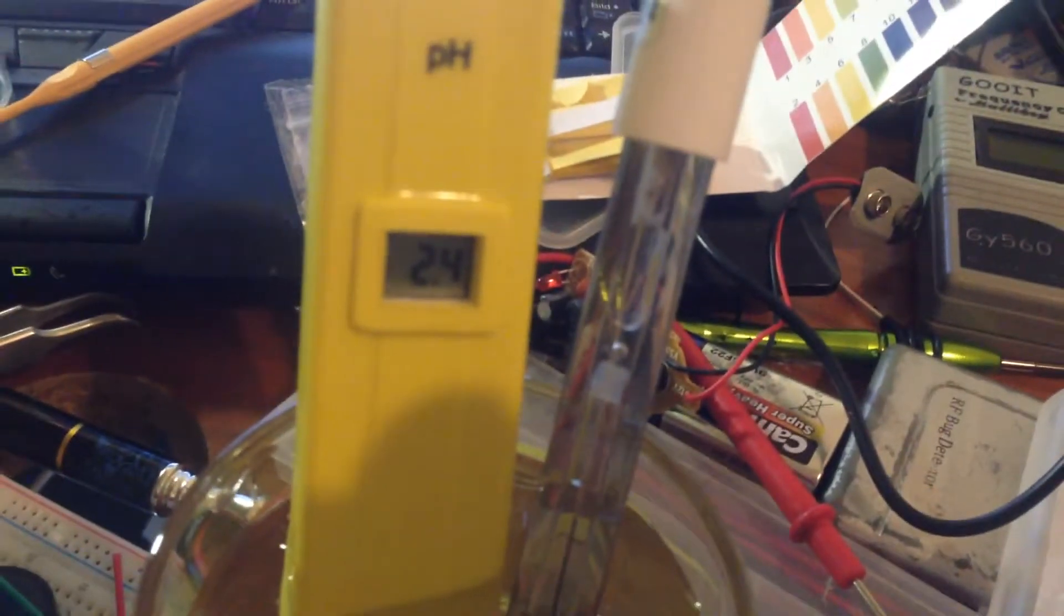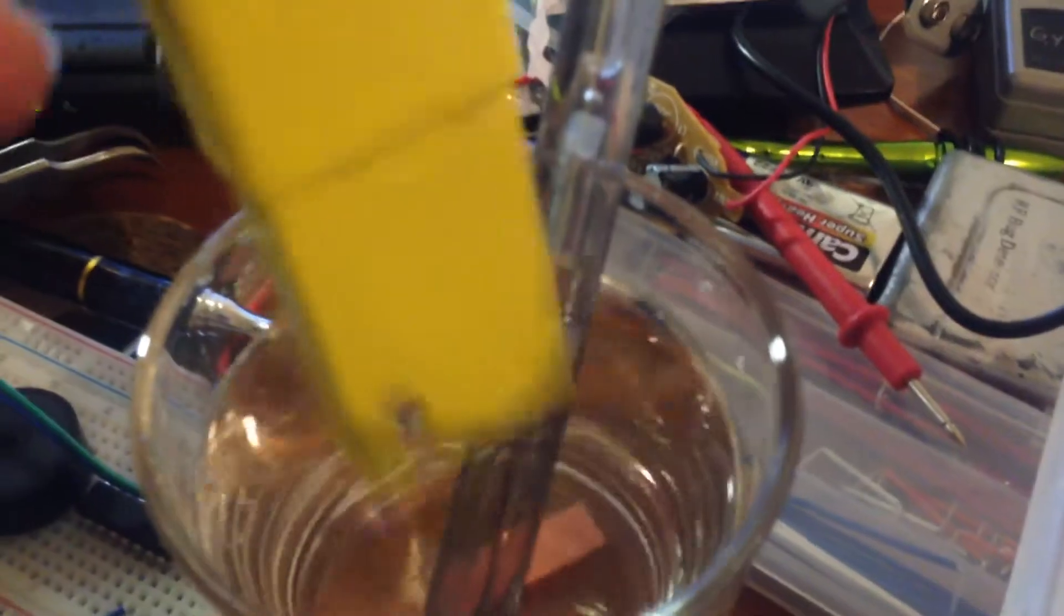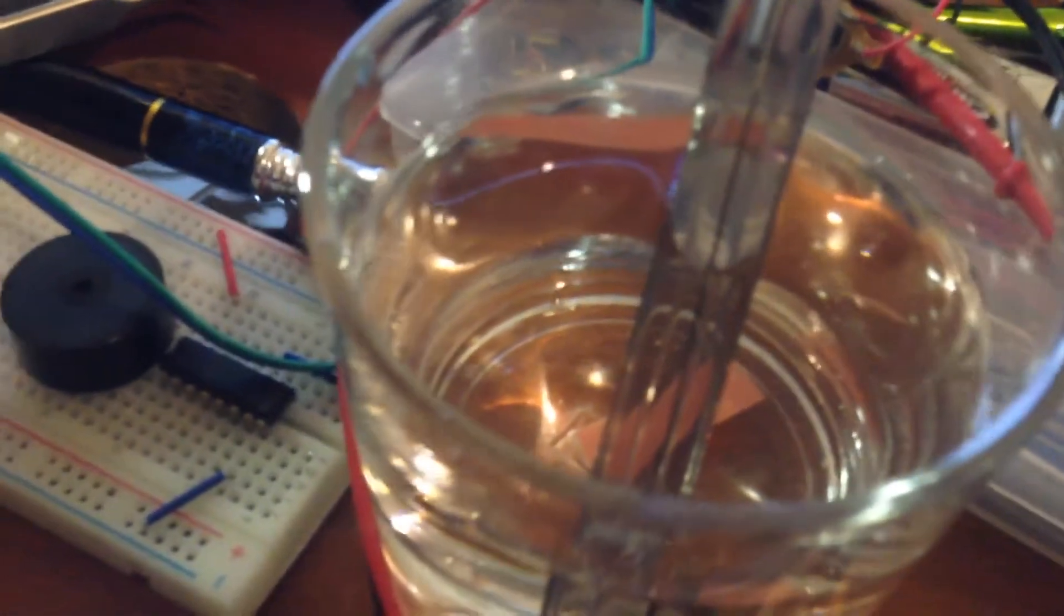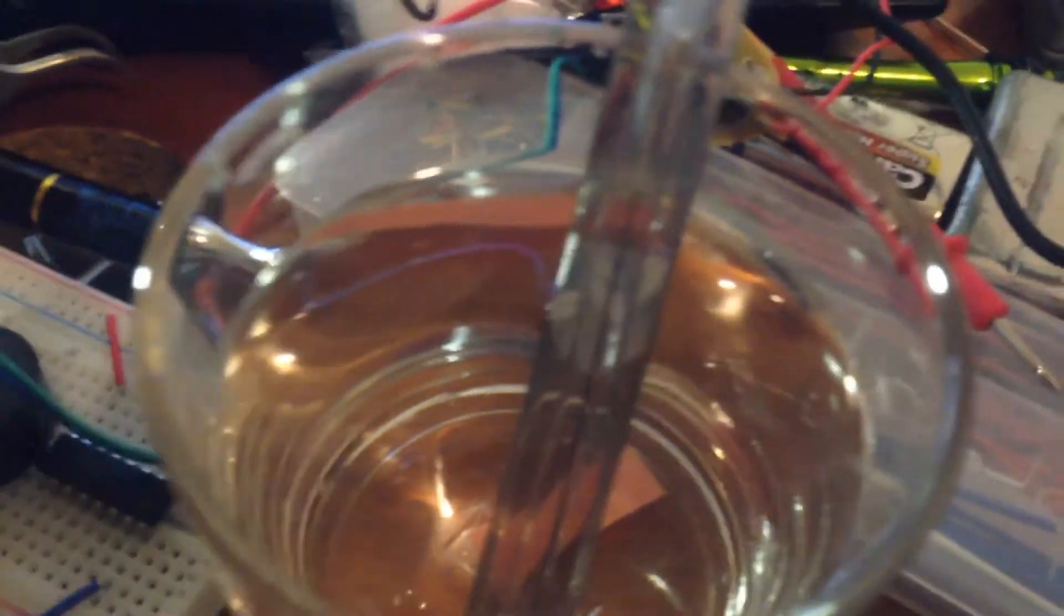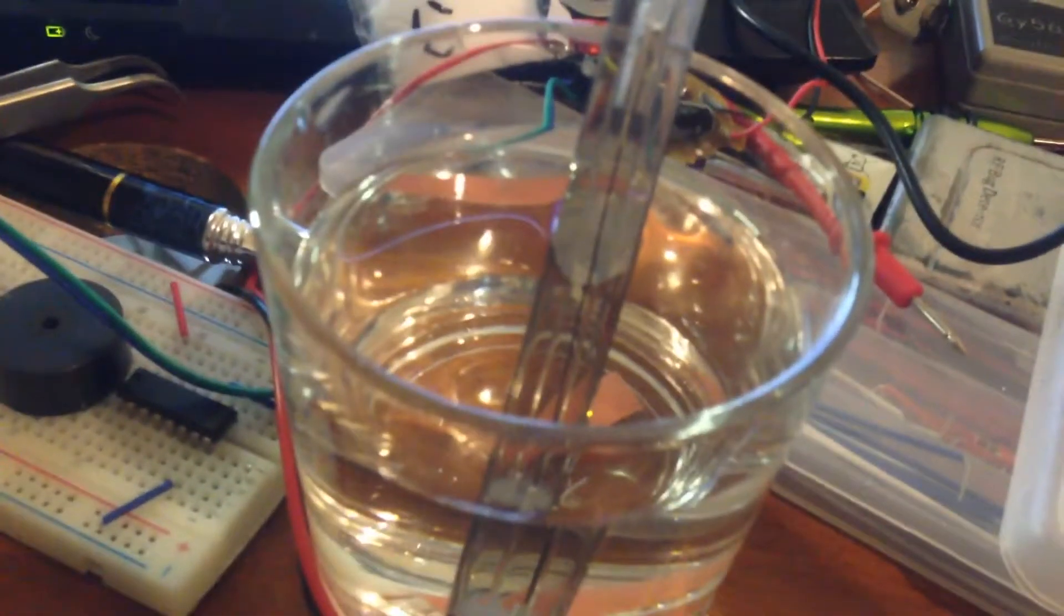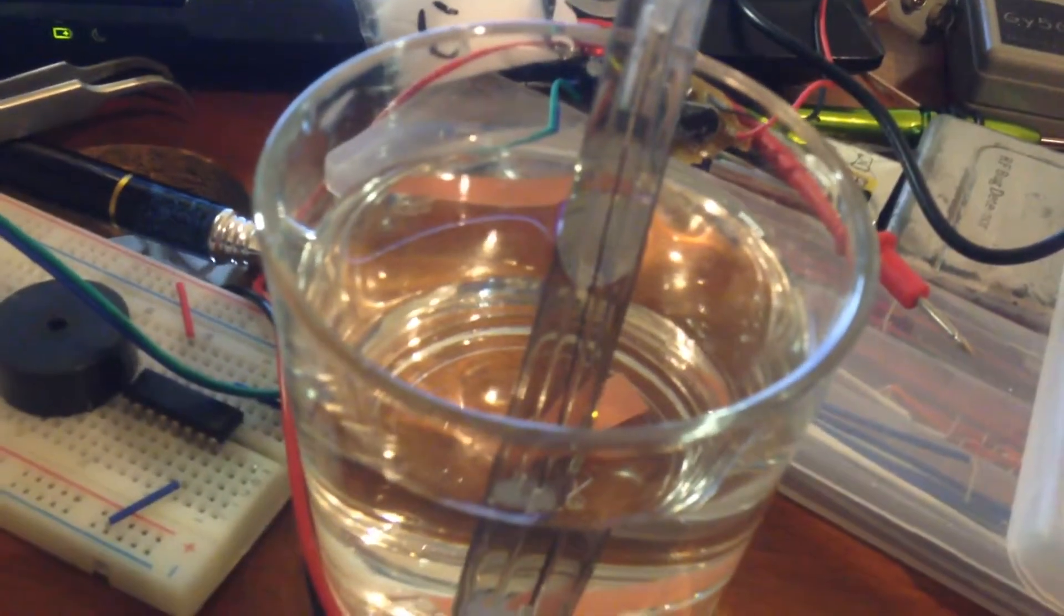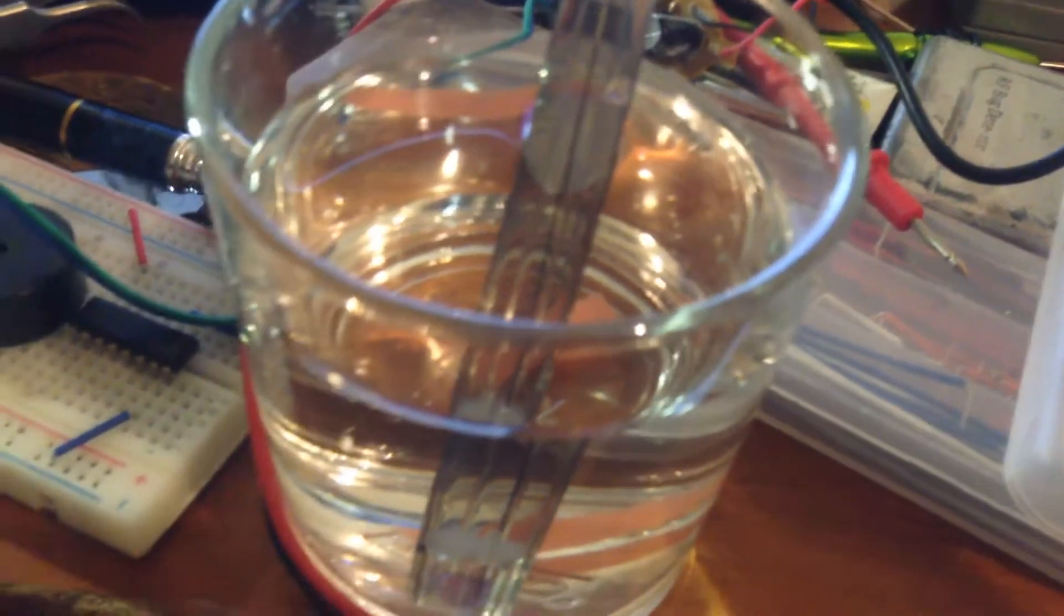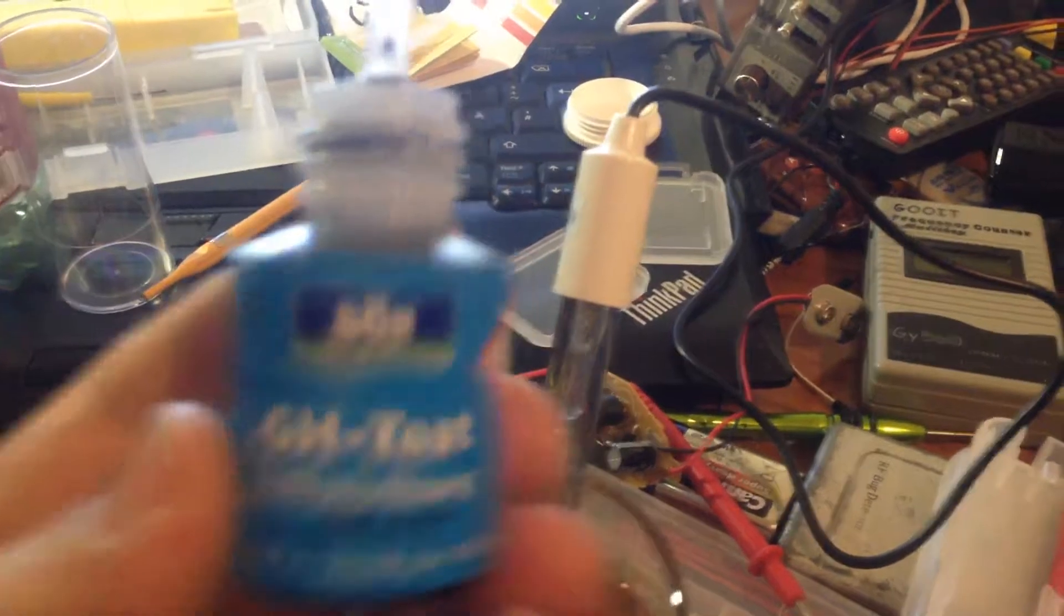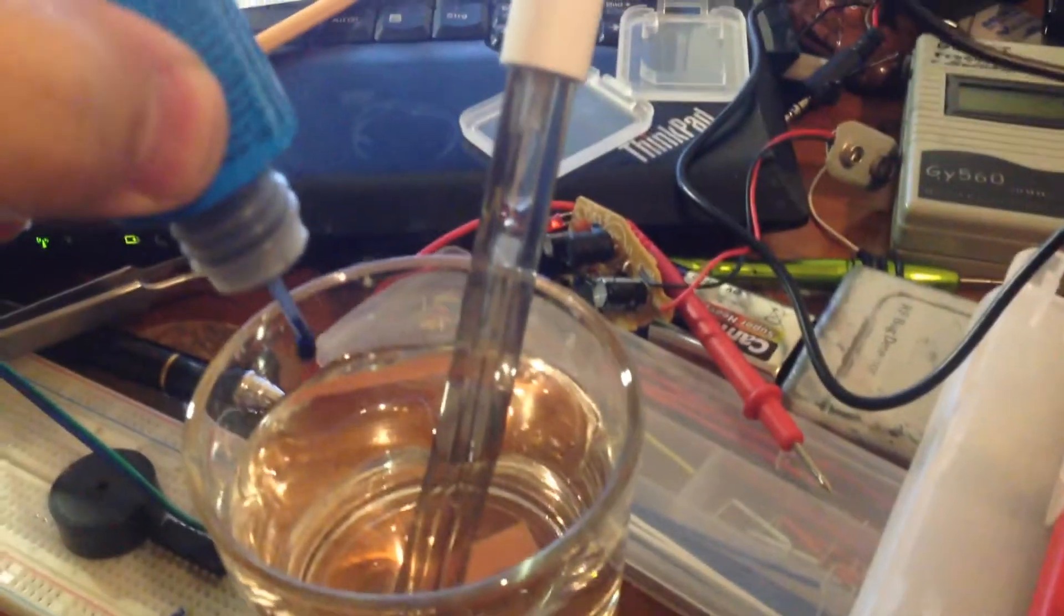I will also try to check the pH with the liquid pH tester. The liquid pH tester difference is the color of the pH liquid tester. Usually for the aquariums or the swimming pools, they use this liquid.